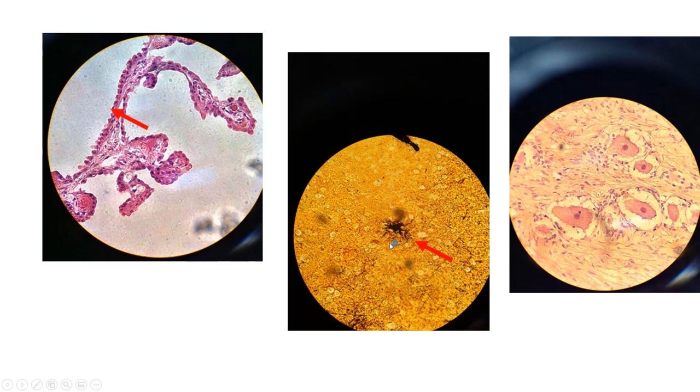Here's a microscope slide of an astrocyte. Remember, the astrocytes form the blood-brain barrier. And then over here, it won't make a whole lot of sense right now, but this is a dorsal root ganglion, which is right outside the spinal cord. Dorsal root ganglia contain sensory neurons. So these are sensory neuron cell bodies. And the cells that surround them would be the satellite cells that we talked about, a type of neuroglial cell.